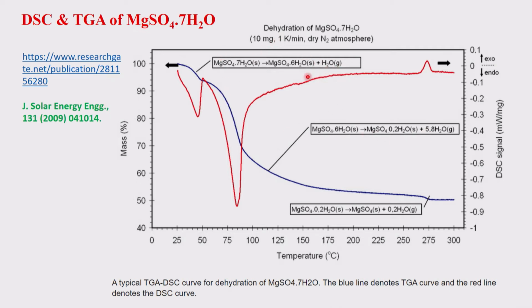So, the first water loss gives a huge endothermic peak here, and there is another one here, which becomes exothermic by the time you have gone to temperatures beyond 200, beyond 250, beyond 275. You can see that two of these three are endothermic, and one is small but exothermic, and that is a characteristic pattern for that particular sample.